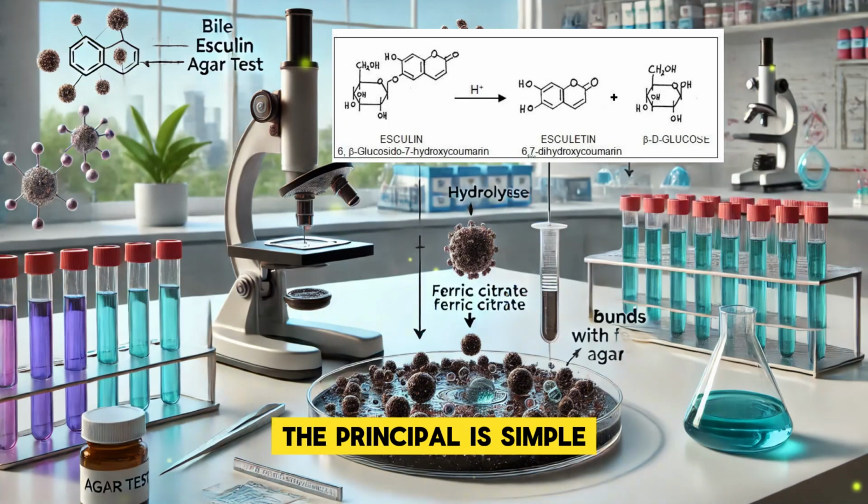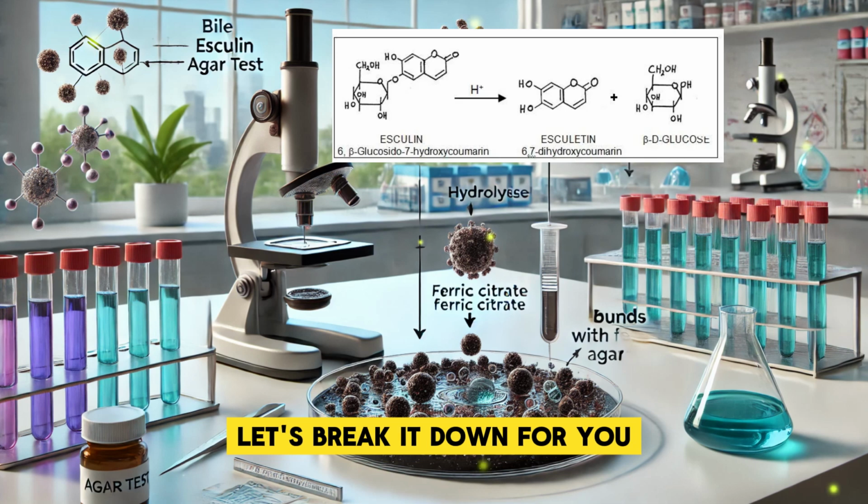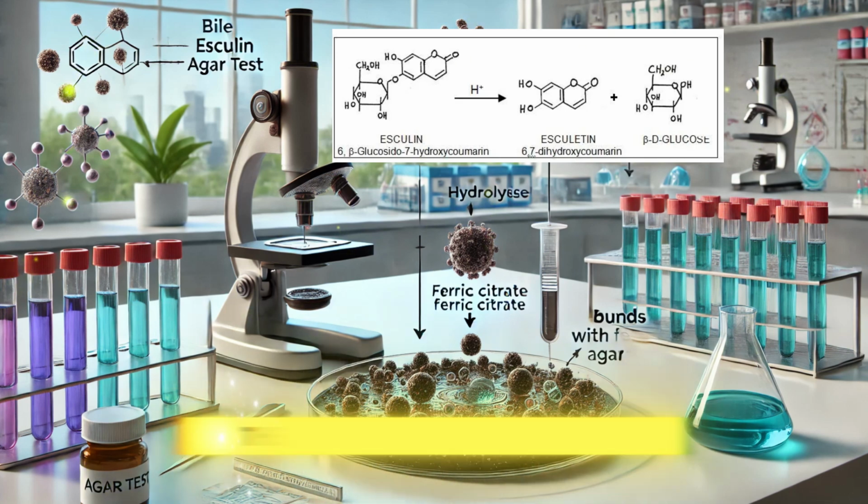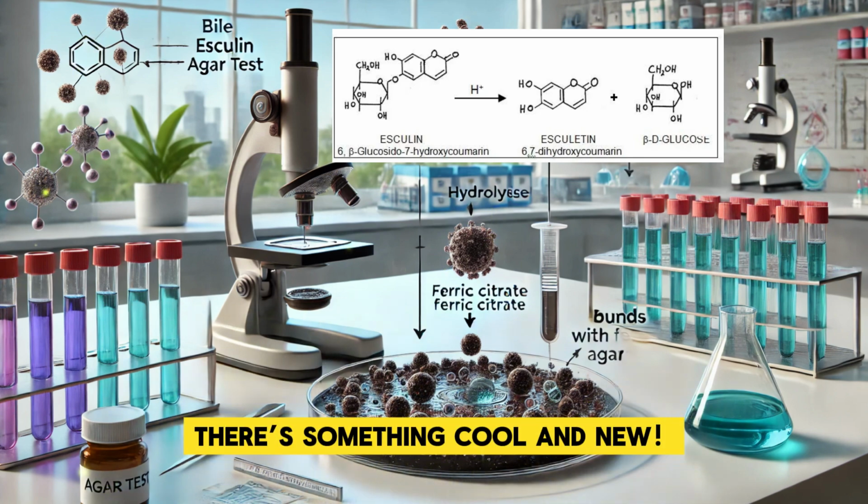The principle is simple. Let's break it down for you. If esculin is hydrolyzed, there's something cool and new.